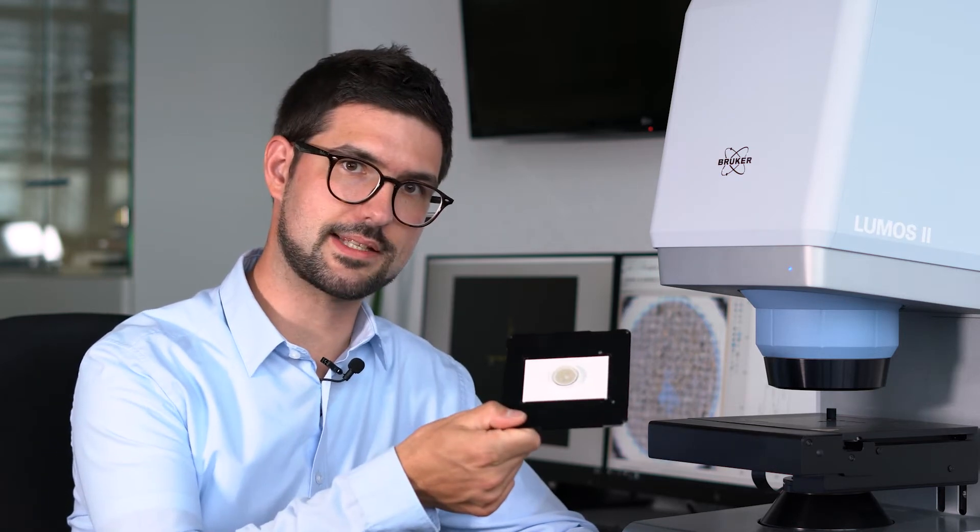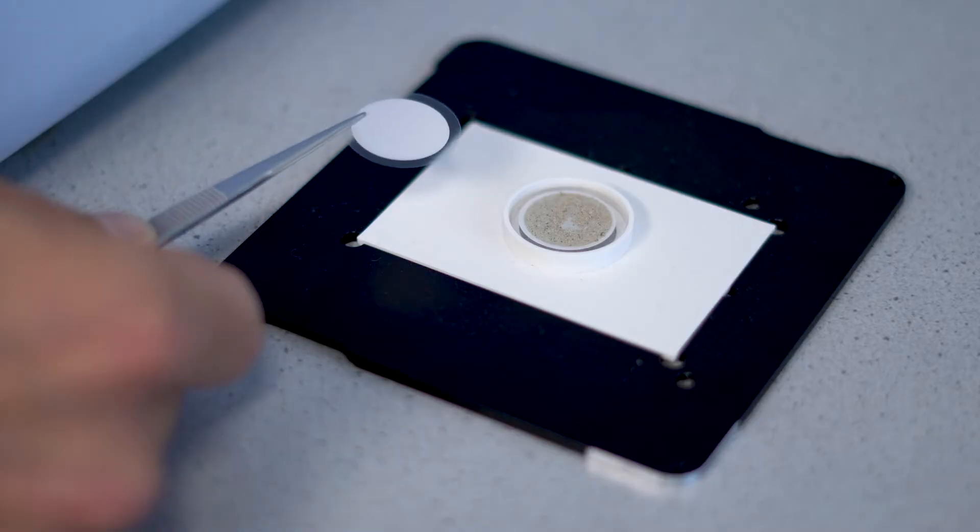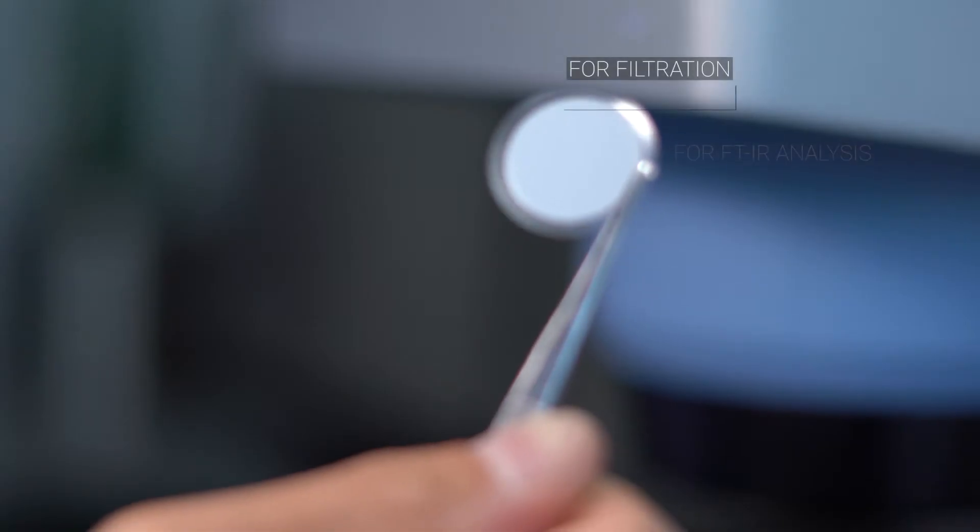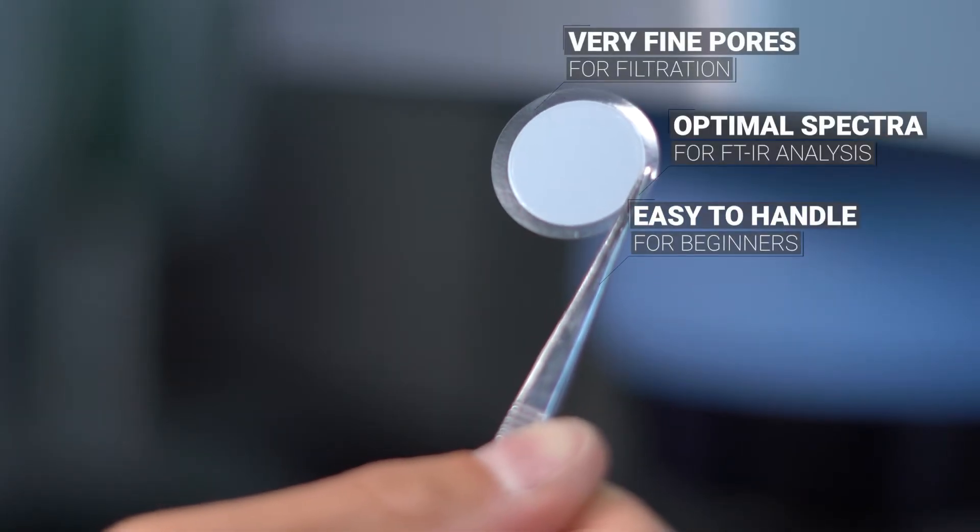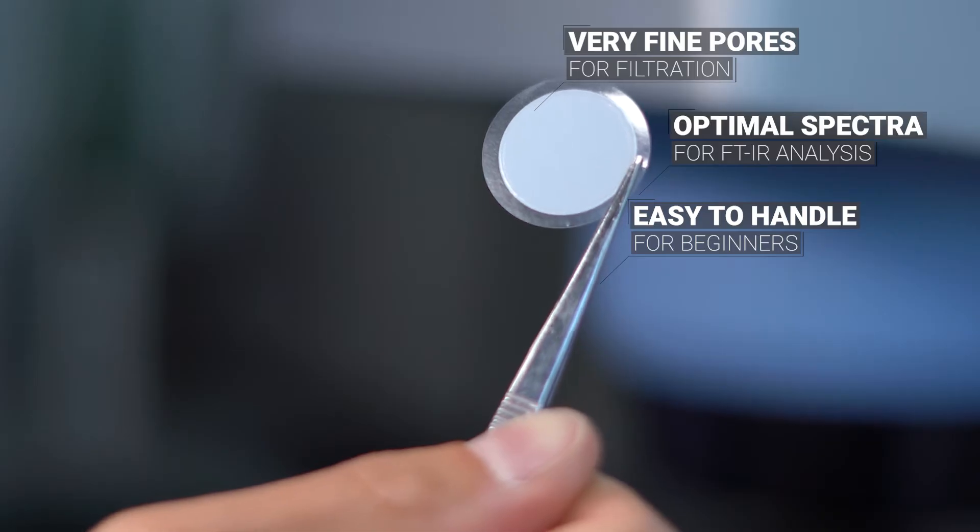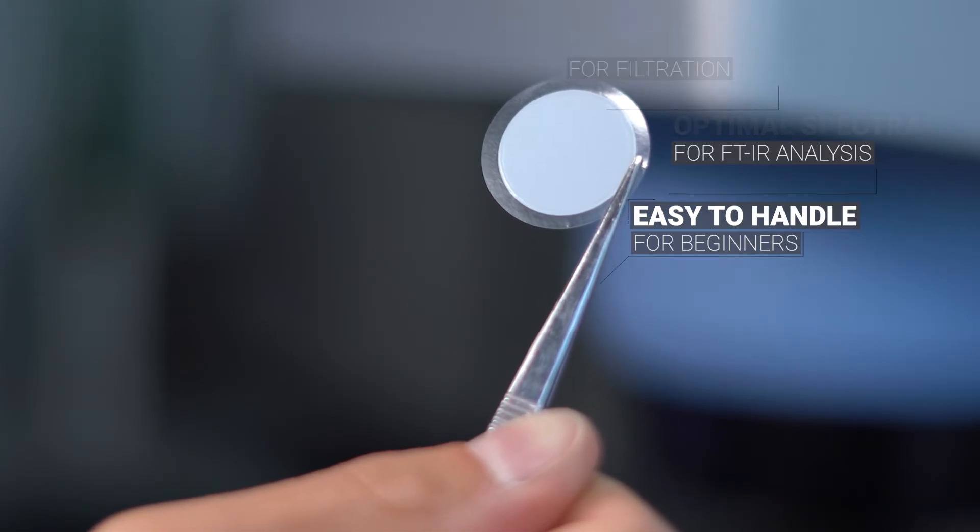But enough talk. Let me show you how the Lumos II microplastic analyzer deals with this microplastic sample on an aluminum oxide filter. These aluminum oxide filters recently have become the standard in microplastic sample preparation. They have very fine pores, deliver superior spectral characteristics, and overall provide users with much healthier microplastic data.